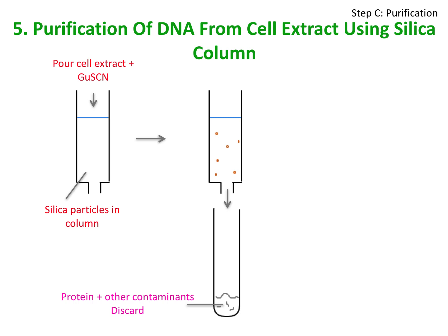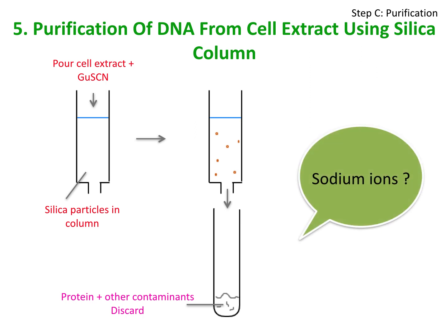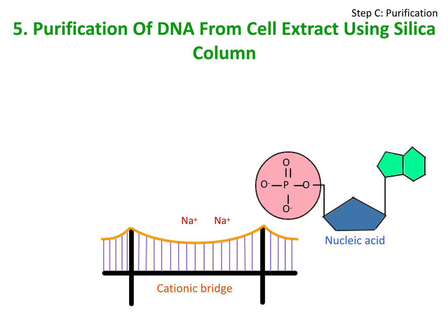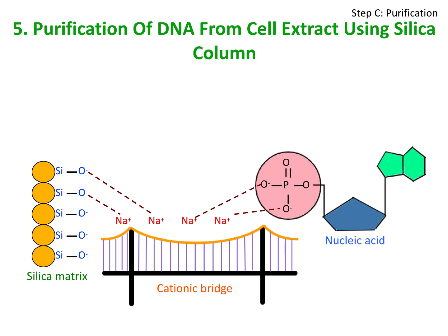In this technique, sodium ions play a very important role. You must be wondering how. These sodium ions act like a cation bridge. Just imagine that there is a cationic bridge made of sodium ions which are connected to the phosphate backbone of nucleic acids on one side, and on the other side the silica matrix is present.